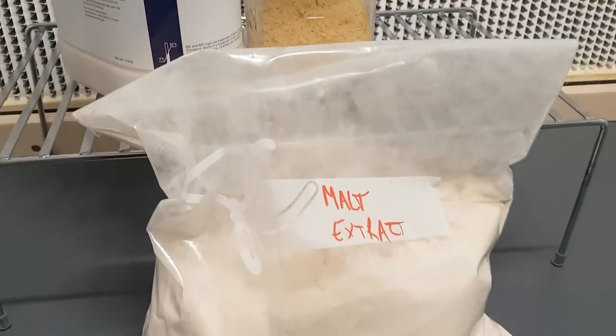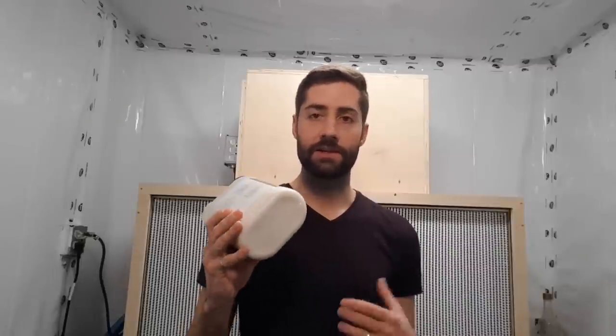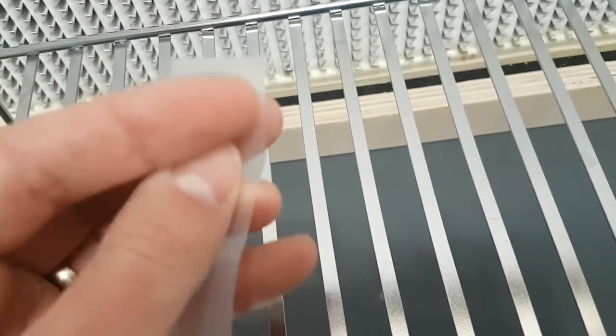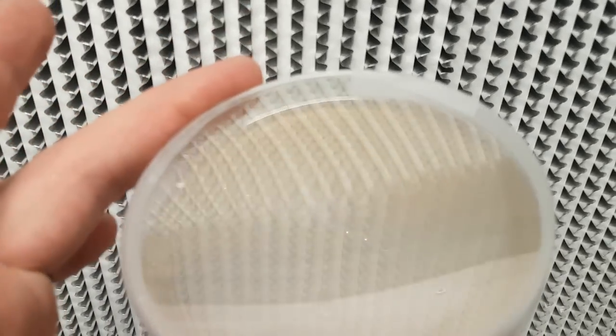To actually make those agar plates, you of course need agar. There are many different recipes — I like to use malt extract, yeast, and agar; there's a video on that if you want to check it out. Basically it's a material that solidifies at room temperature with some nutrition for the mushroom culture to feed on as it grows. To seal those plates, consider getting parafilm — a stretchy, breathable material that wraps around the edges of the agar plate, preventing contamination while allowing mycelium to breathe. A simple masking tape replacement works almost just as well.